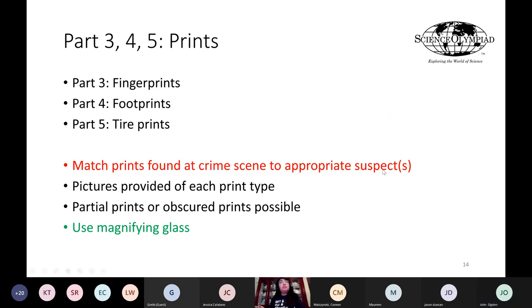When you analyze your powders, first I recommend that you try and use small portions and just use drops of the liquid. So let's say your cup is half full, maybe get a scoop or two, don't use so much, put it on the black paper, and then use drops of each liquid that are in these dropper bottles. We don't want to use too much, or else you might end up wasting that portion of powder that you have, as well as not seeing what physical and chemical changes can happen.